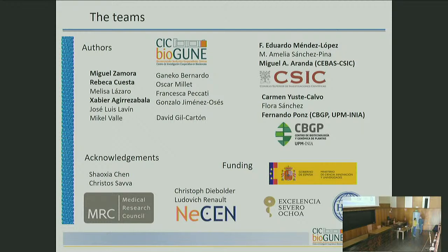We have many comments today here. Luis Fernandez: thanks for your nice talk. A question: disorder seems crucial in both the N and C term segments of CPs. How does cryo-EM cope with this disorder?